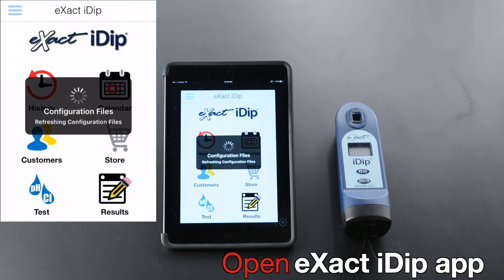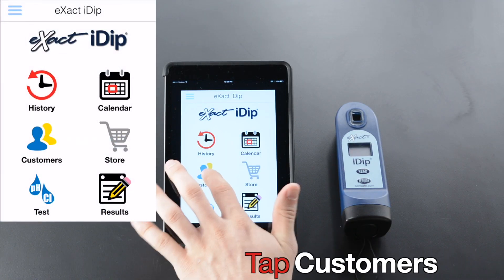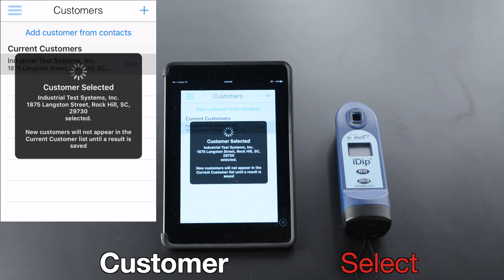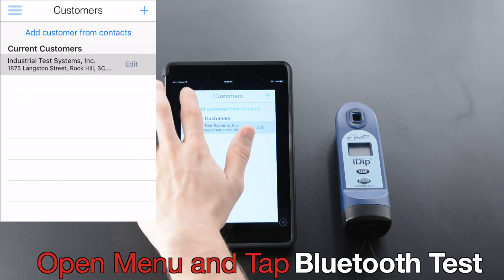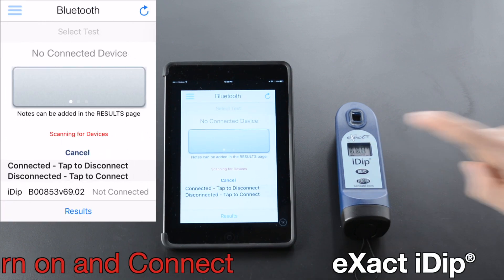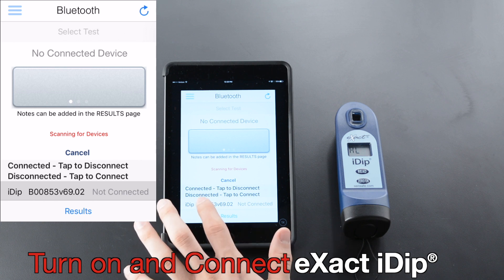Open the Xact iDip app. Tap Customers, select a customer, open the menu, and tap Bluetooth Test. Turn on and connect the Xact iDip device.